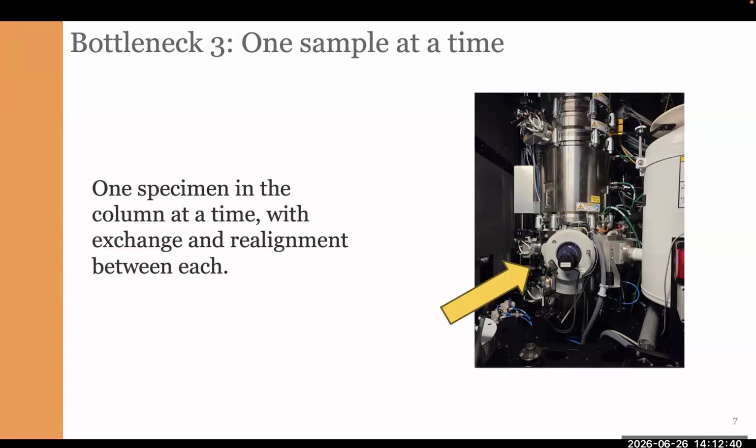So you may argue that there are some commercial systems that allow you to have up to several samples, several grids in a row, with automatic changing of them in the column, but it is still not enough for high throughput characterization, or to follow the rate of high throughput synthesis. So one probable solution is a hardware-based solution, and we already have on the market such systems that allow us to change samples in an automated way.